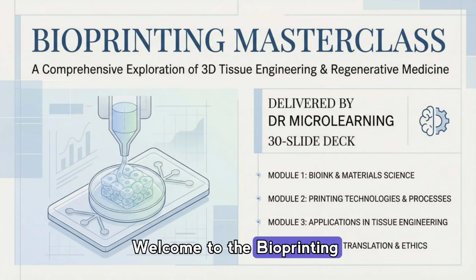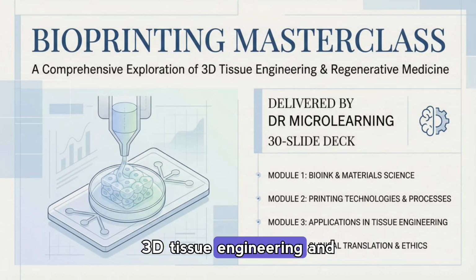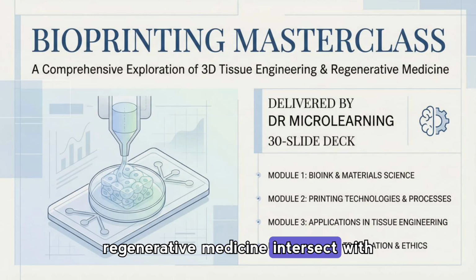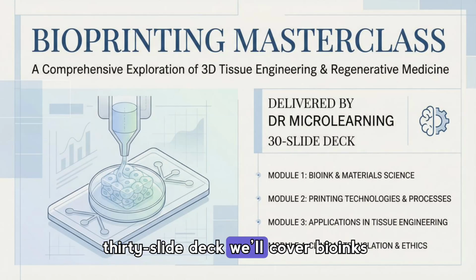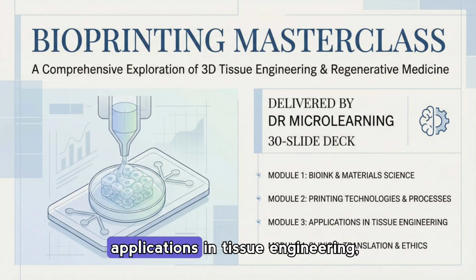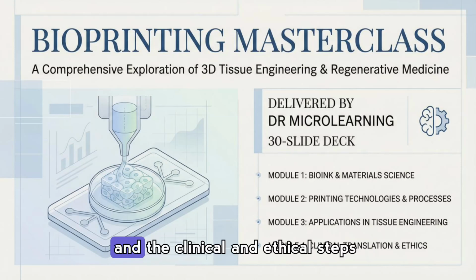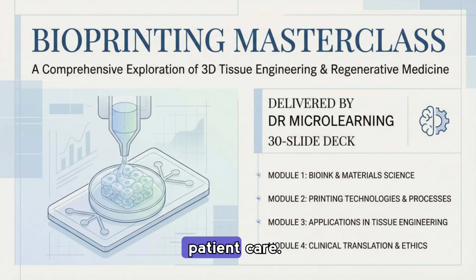Welcome to the Bioprinting Masterclass, where we'll explore how 3D tissue engineering and regenerative medicine intersect with additive manufacturing. Over this 30-slide deck, we'll cover bioinks and materials, printing technologies, applications in tissue engineering, and the clinical and ethical steps needed to translate lab advances to patient care.